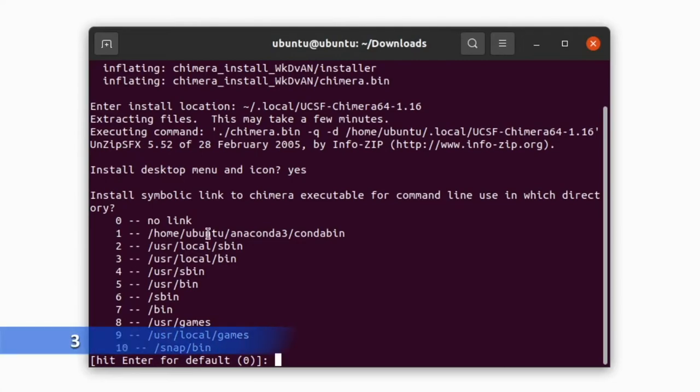If you want, you can create a symlink to Chimera. You can select any option. I am choosing option number three.